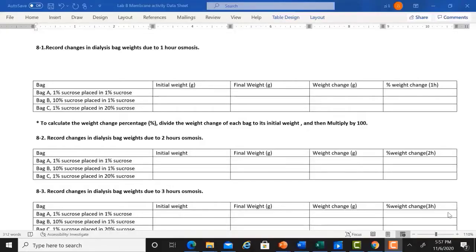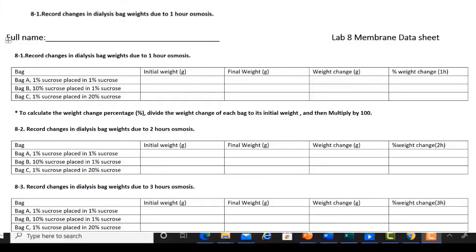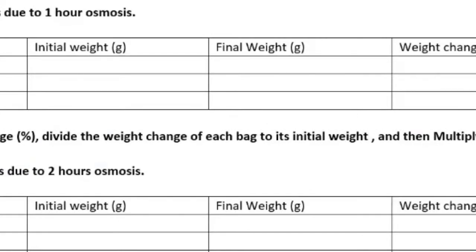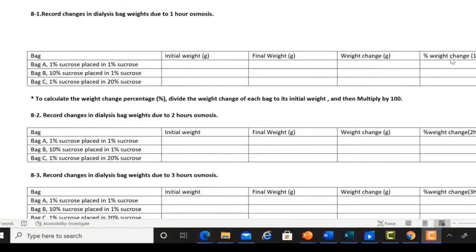After the instructor shows how to assemble the three bags A, B, and C, you will be asked to record the initial and final weights of each bag after the experiment has run for 1, 2, and 3 hours. Later I will show you how to measure weight change and also how to calculate weight change as a percentage. So let's start.